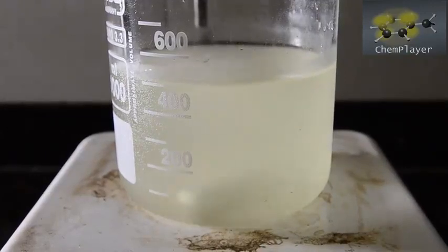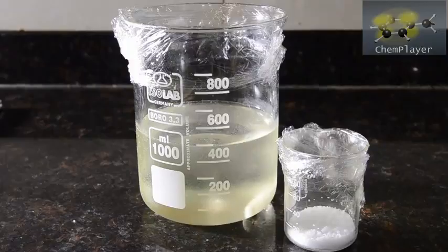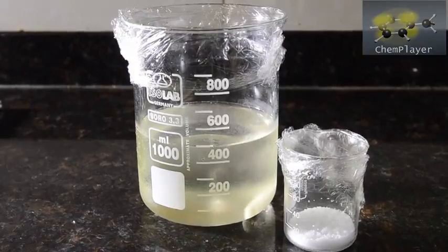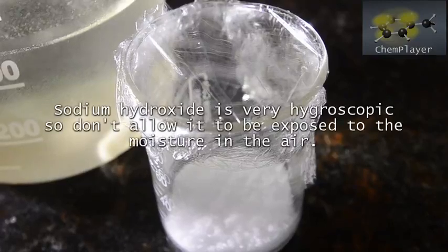Now we're going to chill down the bleach mixture again until it's back down to about 7 degrees. Cover up the beakers, and make sure that the rest of the sodium hydroxide isn't exposed to the atmosphere, otherwise it will absorb water rapidly.